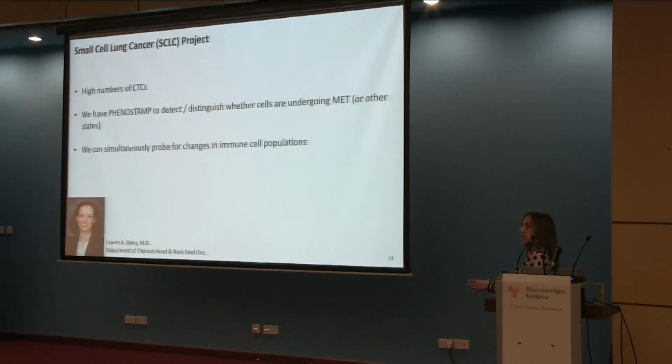Now, I want to mention that we might have to change the phenotype, how we build it, with different markers because small cell is a very different cancer, but I'm just talking about the approach. And then at the same time, we can look into the immune changes. It's all about immunotherapy now, right? You can see what the cancer cells look like, and is the patient responding to immunotherapy, all with one CyTOF run, right? And this is the collaborator, an oncologist that works specifically in small cell at MD Anderson.